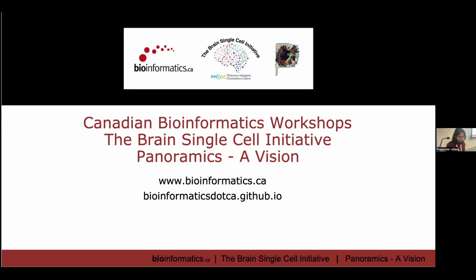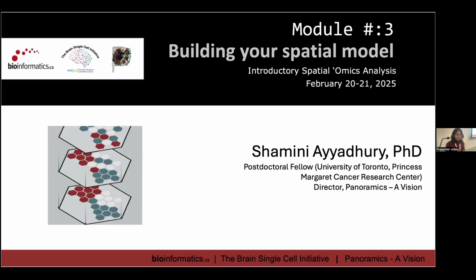So here in this module, module 3, every module is supposed to be a follow-up of the previous module. The first part, Savannah brought you through cleaning up QC, how to exactly look at your data. So this is your raw, fresh data out. You're looking at counts, you're looking at your features, genes, and you're trying to decide, okay, how much do I clean it up? And then you're going through that first process of normalization.